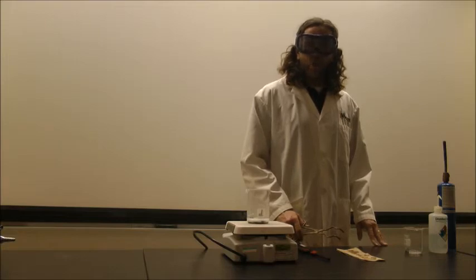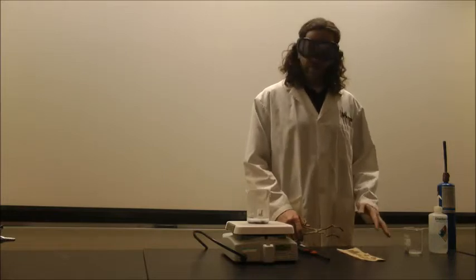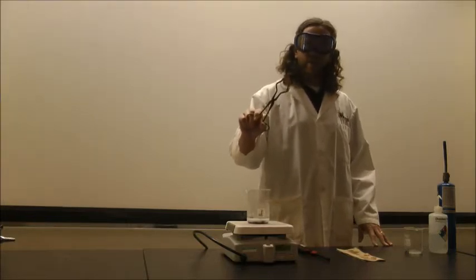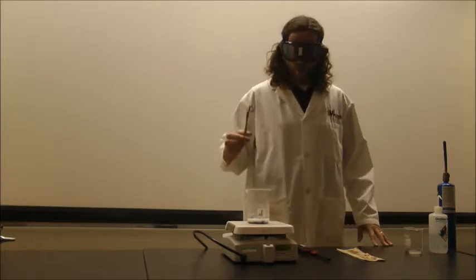The progenitor of chemistry was a discipline known as alchemy. The primary goal of alchemists was to do transformations. Modern chemists like to do transformations as well. And so one of the key transformations that an alchemist strove to do was to change base metals, like this penny, into more precious metals like silver or gold.